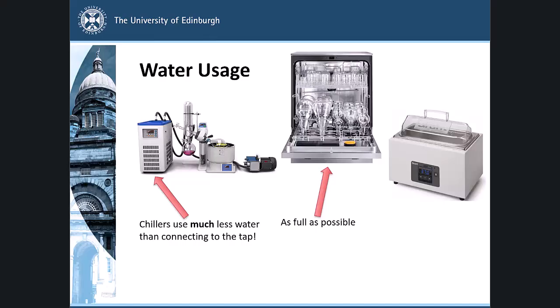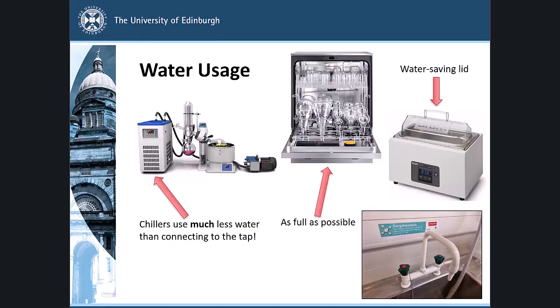Water baths should have lids on them that prevent water loss due to evaporation. Finally, if you spot a leaking tap, report this to the school's buildings team straight away.